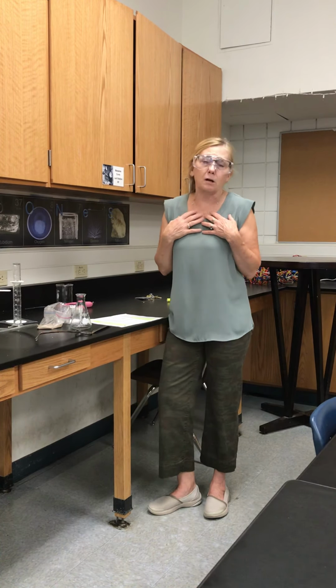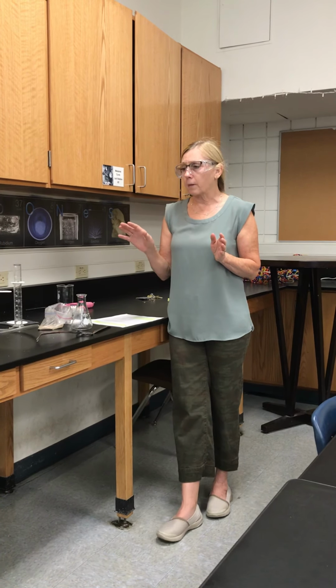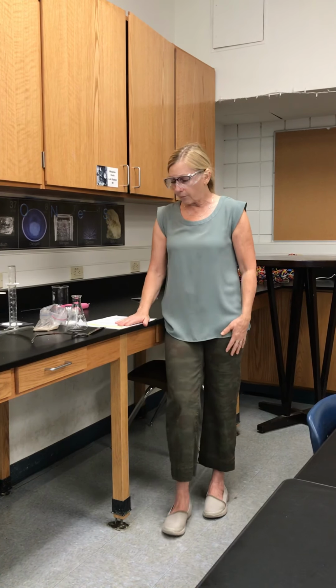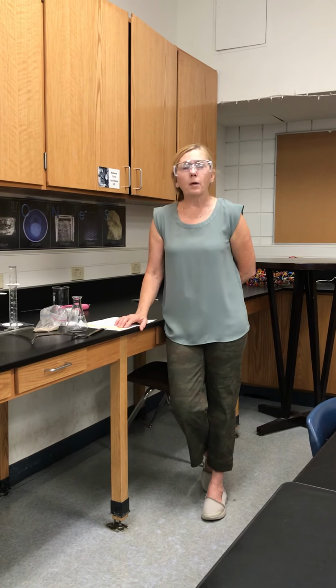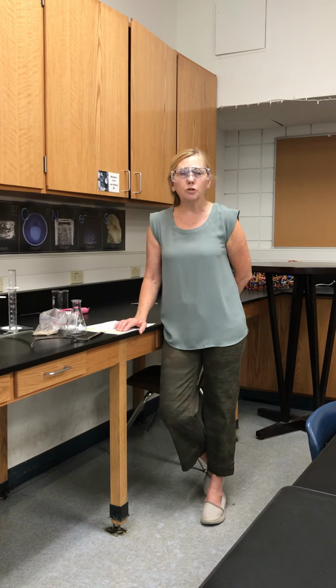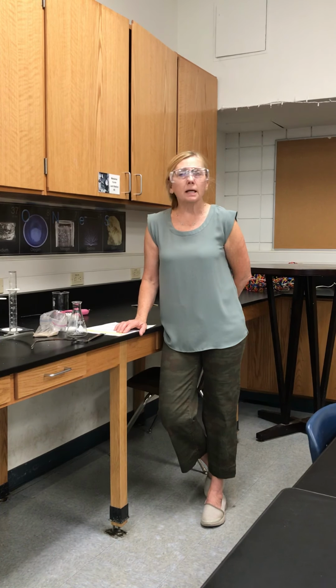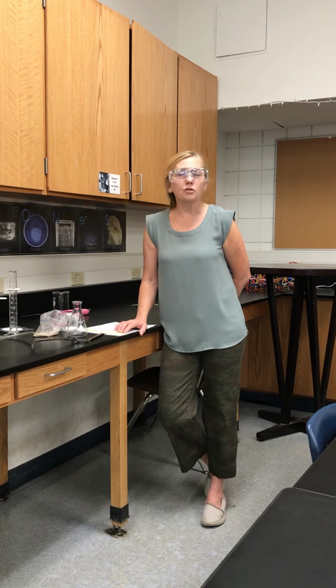Our bodies need salt. So today we're going to look at these physical and chemical changes lab, and for a special note, it's really important to know when you're observing a chemical change, how to identify that. Now in some cases, as in when you're boiling water, that's just a phase change.